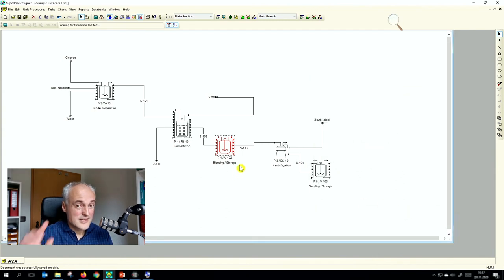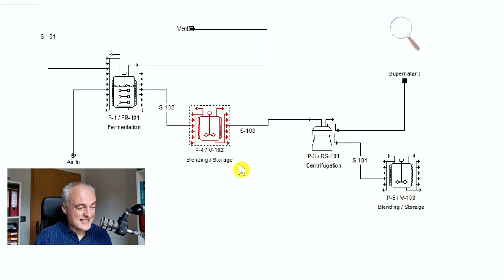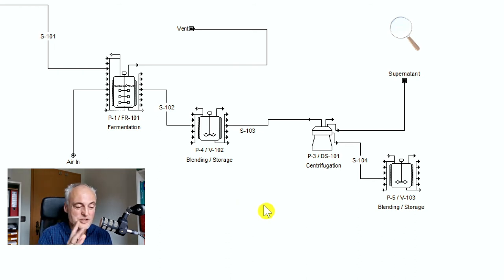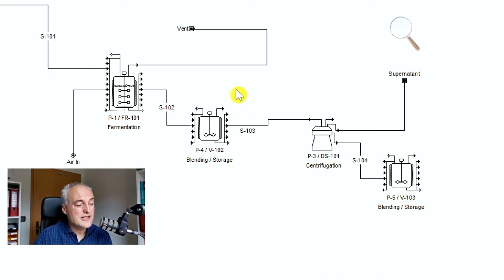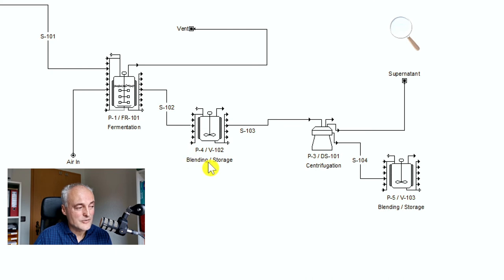To summarize: the centrifuge starts when the blending storage tank transfer out starts; the tank transfer in automatically precedes that; and the time of the transfer out is dictated by the centrifuge to achieve 97% separation efficiency. Scheduling and master-slave relationships are separate concepts.